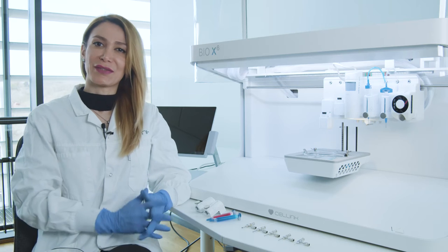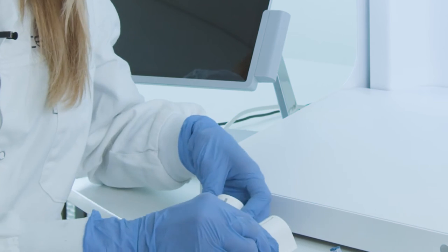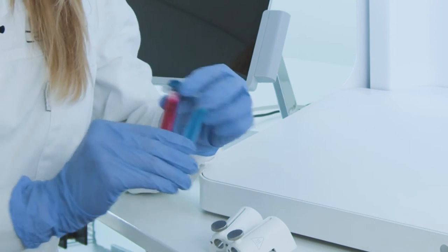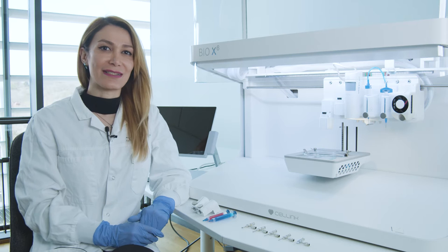Today we are going through the coaxial bioprinting process step by step using our advanced Bio-X6 bioprinter. The requirements for coaxial bioprinting are two pneumatic printheads, bioinks for inner and outer layers, and of course coaxial nozzles, which are available in different gauge sizes and lengths.